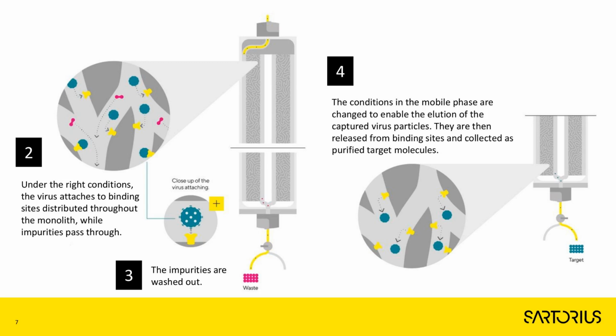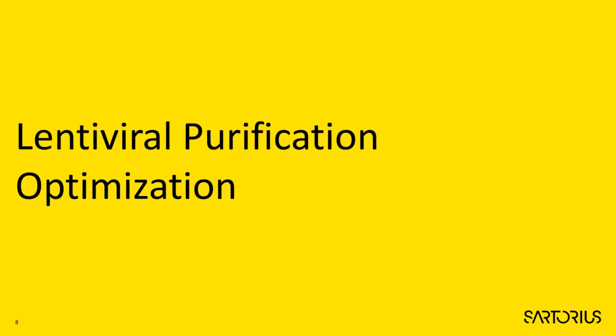And now I will present to you the case study with the monoliths on the lentiviral purification optimization.